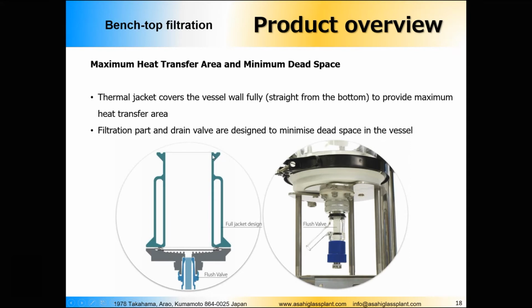And depending on the volume of the vessel, this can be a relatively big volume. So for example, if I'm not mistaken, for the 5-liter reactor, the dead volume, which is not heated at all, is close to 500 or 600 milliliters, which is pretty high, I would say.